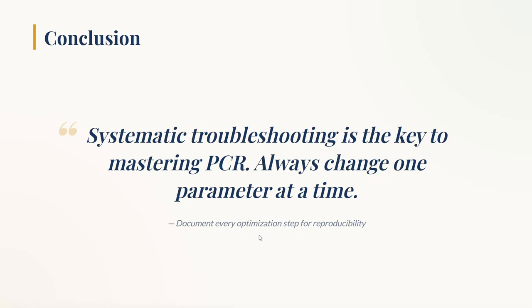Document every optimization step for the reproducibility. Why? Because once you have got the result, make sure the same changes that you made will give the same result in the next reaction also. So if you have checked 2 or 3 times and you're getting proper result, that means you got the issue and you have successfully troubleshooted it, right?